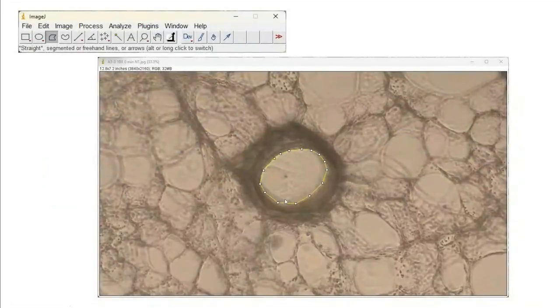Prior to the contraction process, let's say I added 5 micromolar. I had Hanks balanced salt solution, and I had a contractile ring of this dimension, with this amount of opening, and we used ImageJ to quantitate the area.